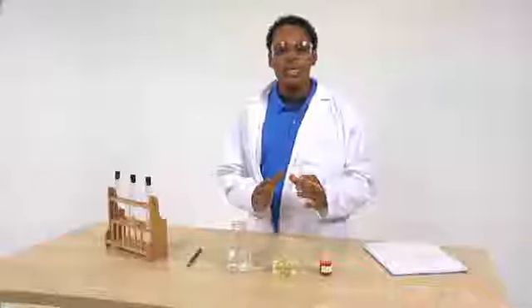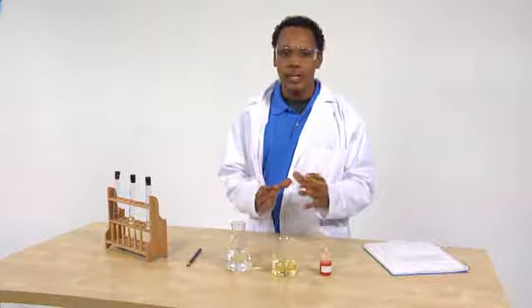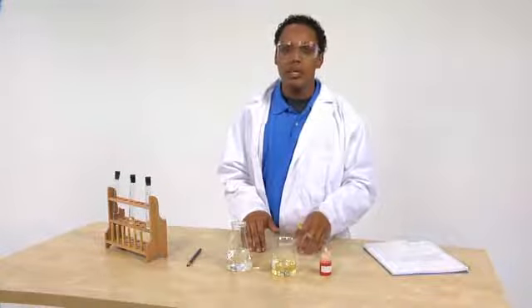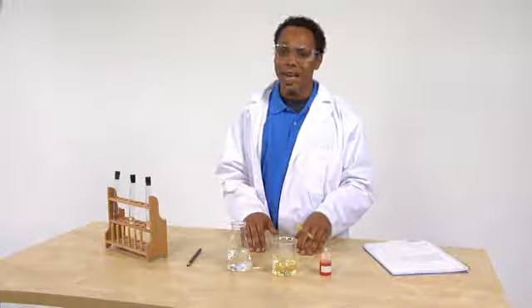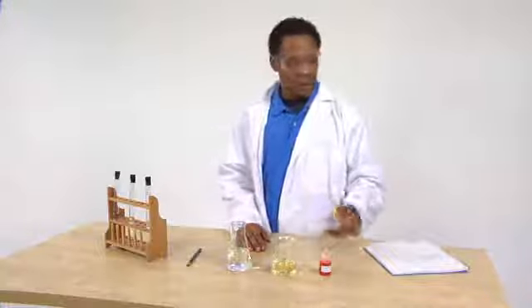Because Sudan 3 is an indicator that identifies the presence of lipids or fats in liquids, this same procedure can be used to test other food types. I'm getting hungry. Time to clean up and wash my hands so I can get back to my lunch.